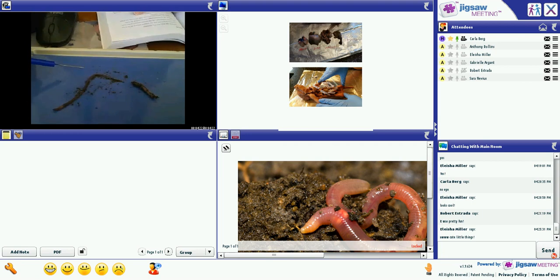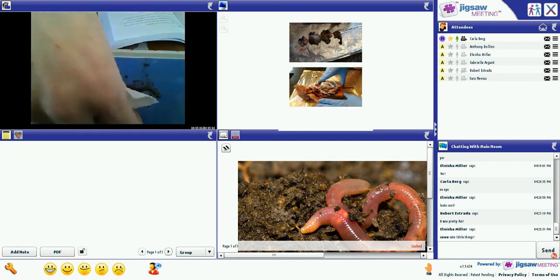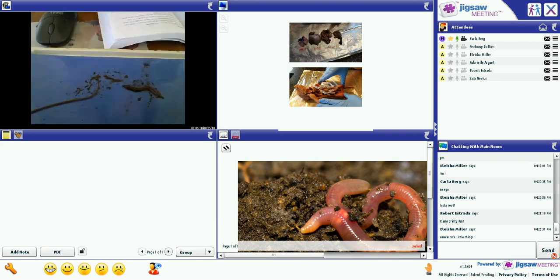But when we are looking at the worm, there is a thickened portion of our worm. Now, on my worm, this thickened portion is right here. It is closer to his head, his anterior end. Here is his posterior end. Now, the only reason I know which is his anterior and his posterior is that thickened area of his body is closer to his anterior or head region. See if I can find it on this worm. Okay, and if you look on this second worm, you can see it over.